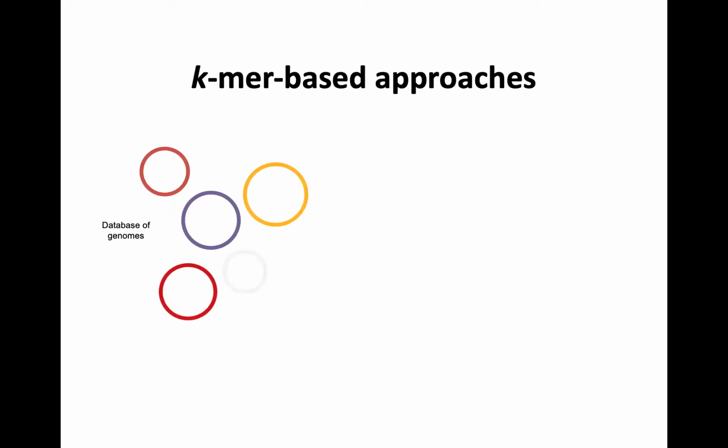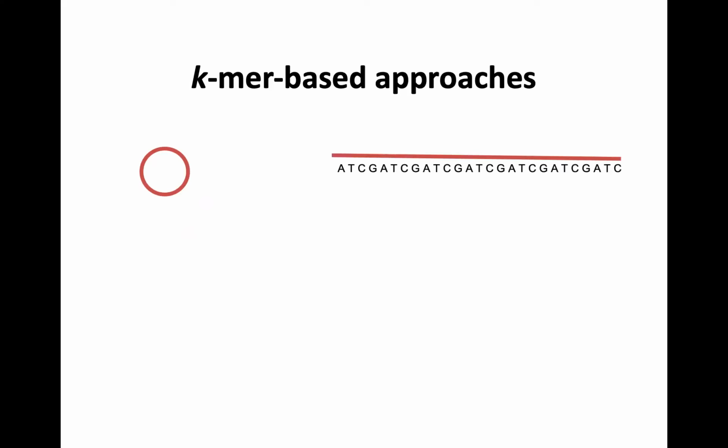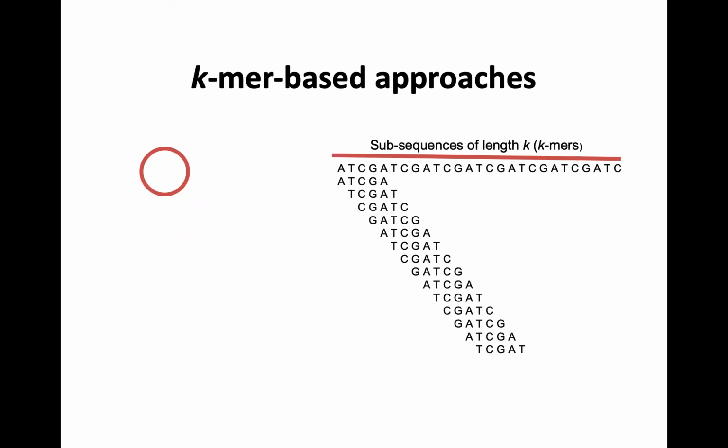So you might have heard about k-mers before. I think it may have even come up yesterday. I stole these slides directly from Robyn. Thank you, Robyn. The k-mer-based approach is essentially taking a particular genome of interest and literally slicing up that genome into k-mer sizes. In this particular case, these are 5-mers, okay? So you say your k size is 5. I'm going to use a k-mer size of 5. It literally will scan along overlapping regions and pull out all of those sequences.